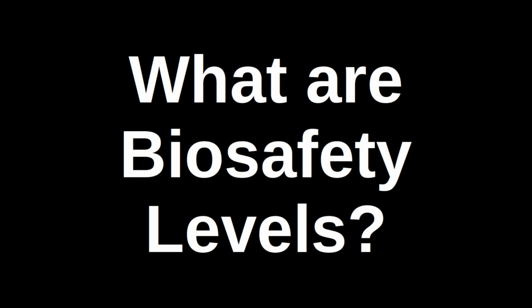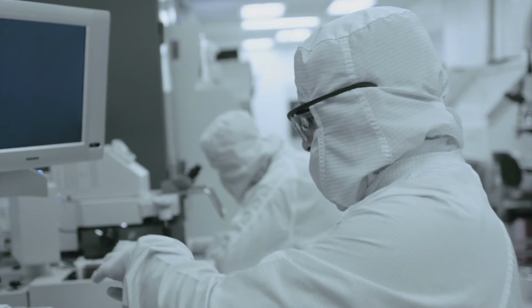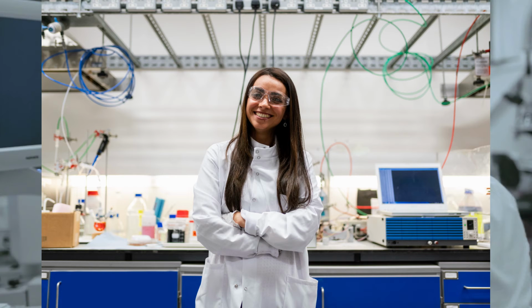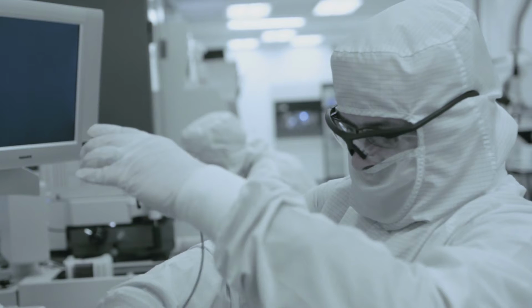Hello and welcome to this video on the different levels of laboratories. These are known as biosecurity, physical containment, and biosafety levels. Although the exact term varies, the meaning is the same. They all apply to a laboratory, regardless of its use. This could be teaching, diagnostic, or research.